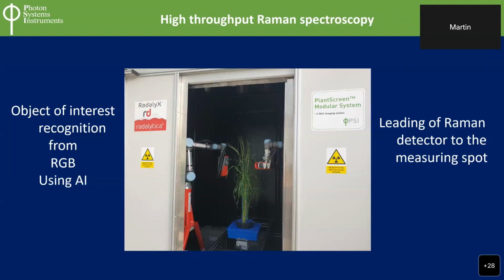What we did here was mount on our X-ray robotic arm the fiber optics, which deliver the excitation light and also detect, so the light which goes back through the fiber goes to the spectrometer. The signal, as I said before, is very low, so you have to point and be super close to the object to get enough signal and enough sensitivity. Then we may do the analysis from individual parts of the object and see the heterogeneity. So then we may have such kind of imaging.